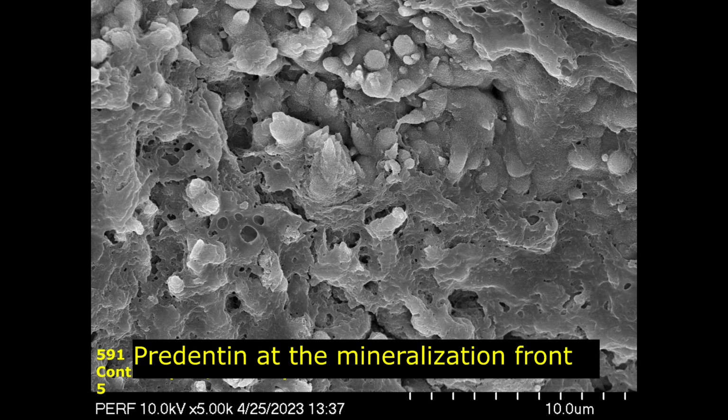And incremental crystal growth in plate-like arrangements as nucleation proceeds hopefully will give SEM structures like this more meaning to you as you understand what is actually happening.